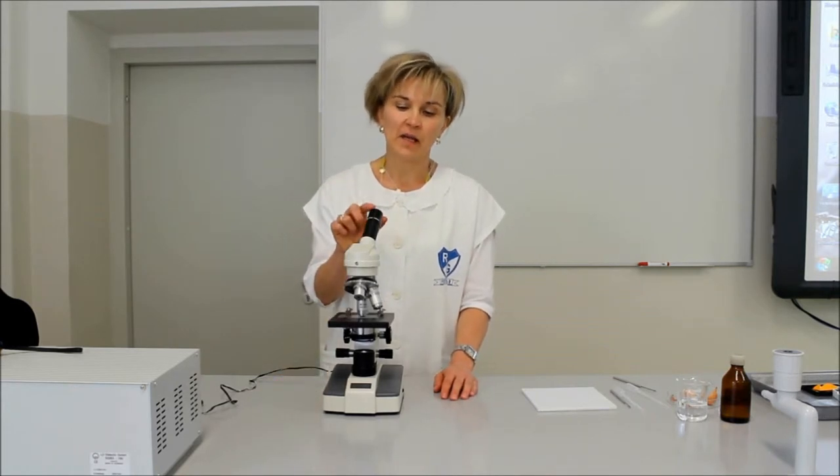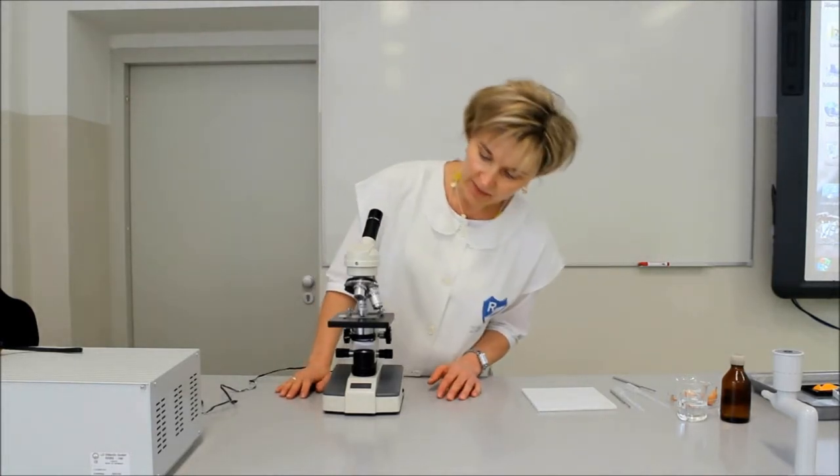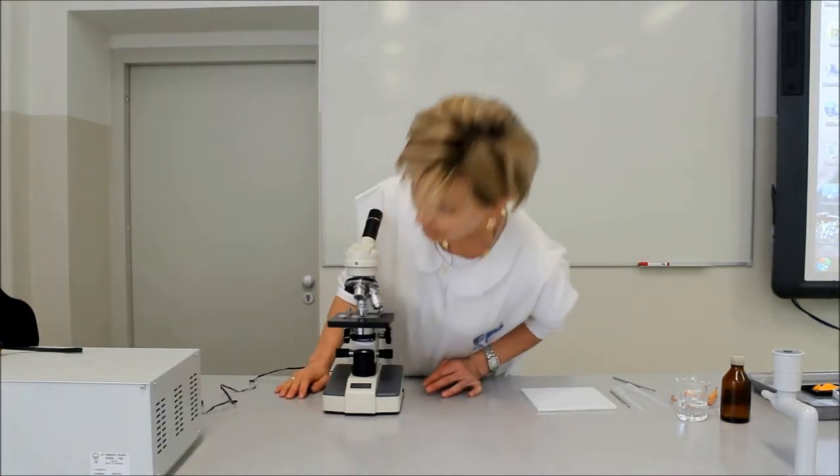The degree of magnification is given by the product of the magnification found on the eyepiece and the objective lens. So we are looking at the examined sample with 10x eyepiece and 40x objective magnification, meaning a 400x total magnification. What we see in our microscope, we will look at on the interactive board.